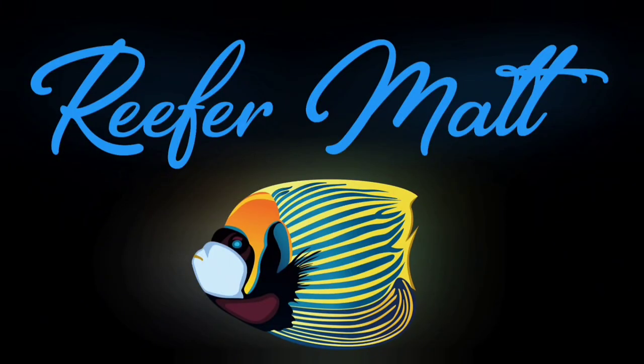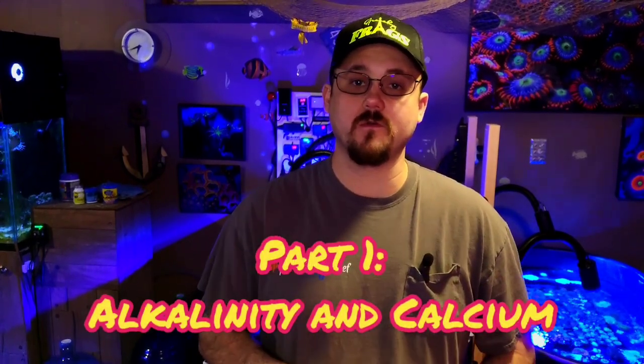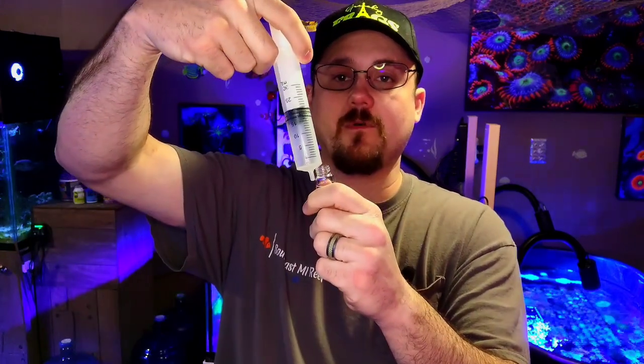I'll start with the alkalinity Hanna Checker since it's the easiest one to use and probably the first one most people buy. My first tip is to get a little turkey baster from the dollar store and take the needle off of it. I don't really go by the graduations on it, but it's great for getting water out of the tank so you can fill the vial more easily than using little droppers.